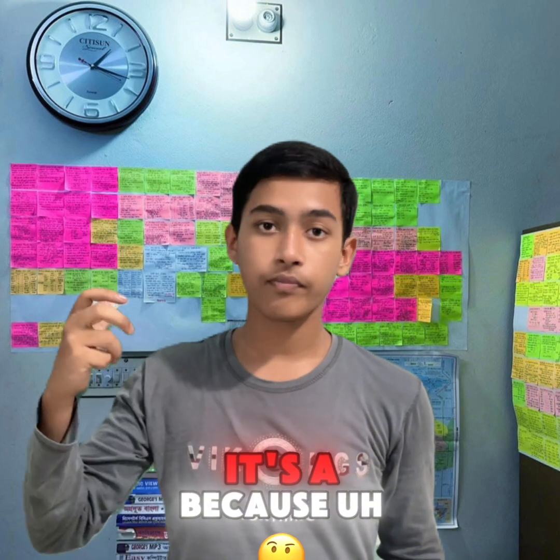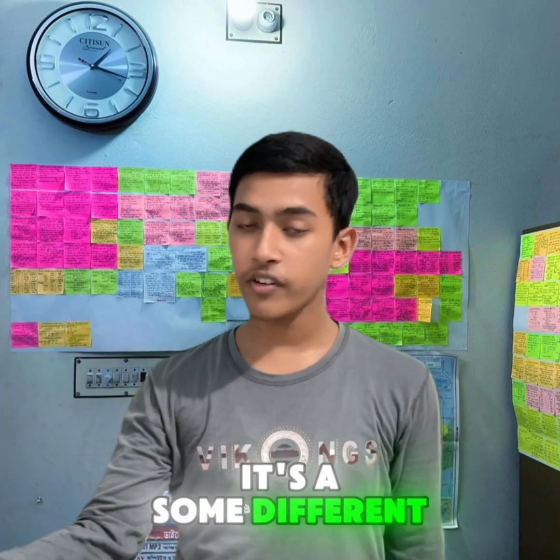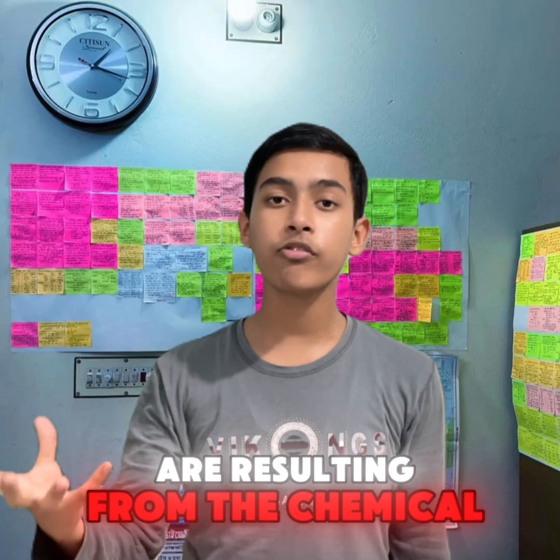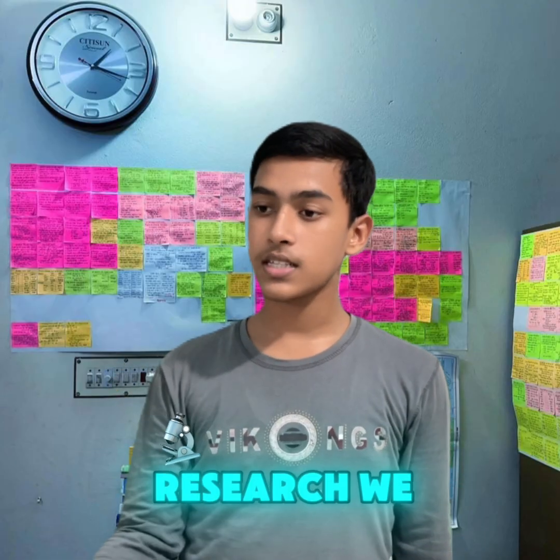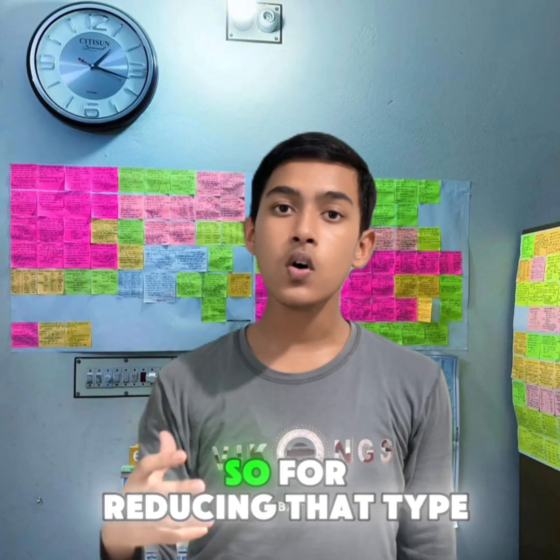Dangerous gases resulting from chemical research may enter our body, so to reduce that we must wear the mask.